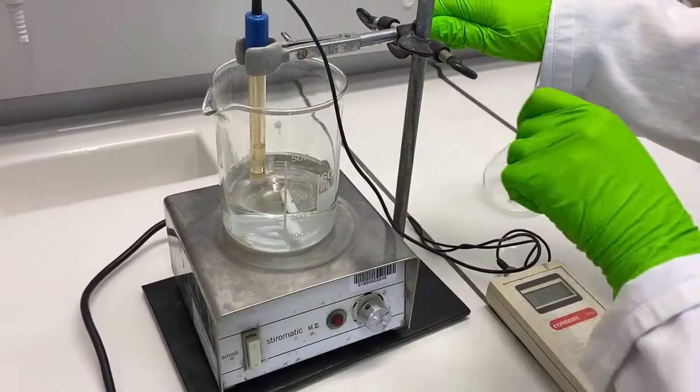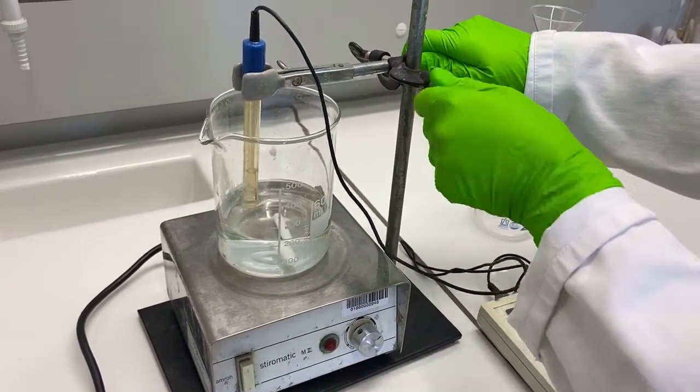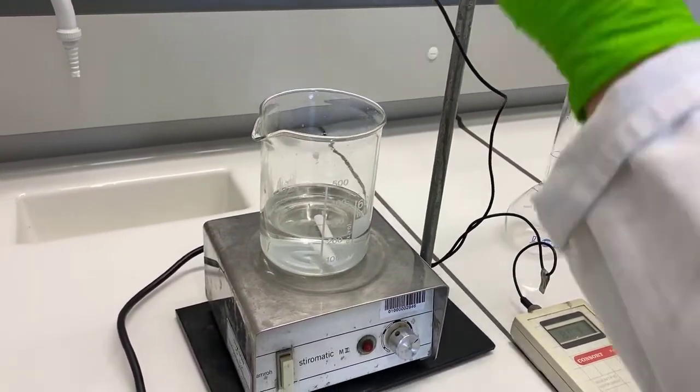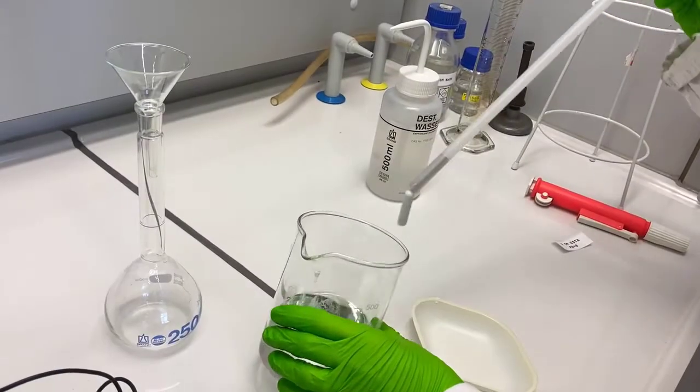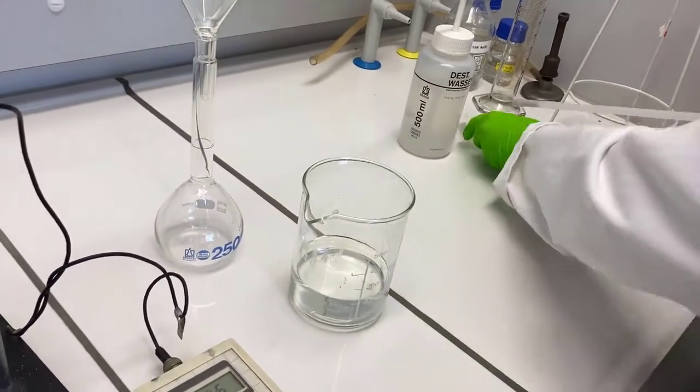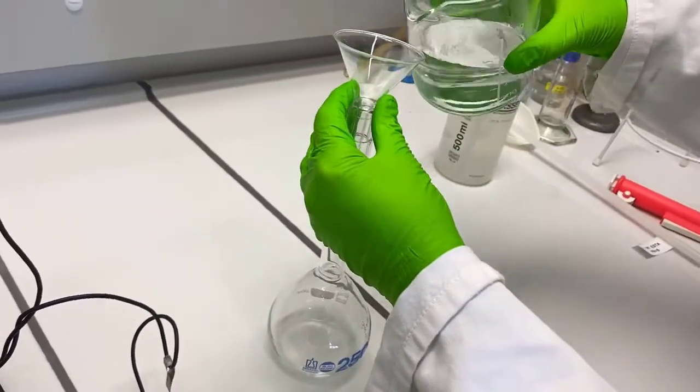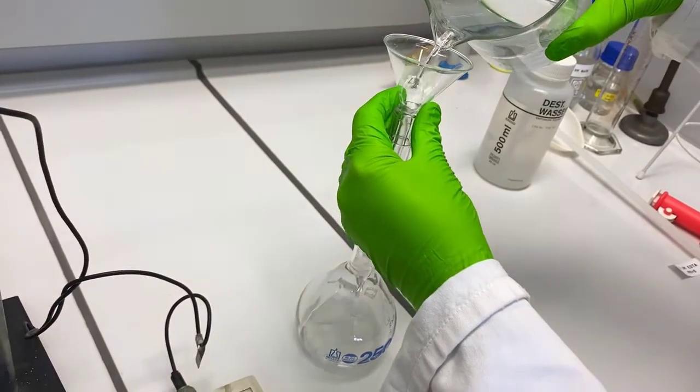Now once the required pH is achieved and all EDTA powder completely dissolved, the preparation of 0.5 molar EDTA of pH 8 will be completed by adding up to 250 ml marking of your volumetric flask using the pH neutral distilled water.